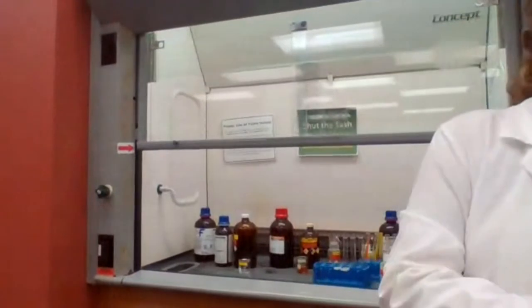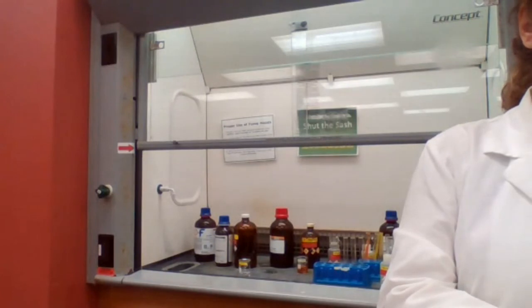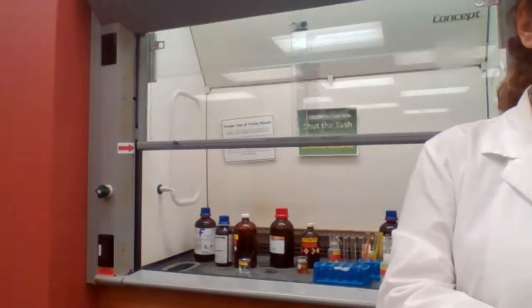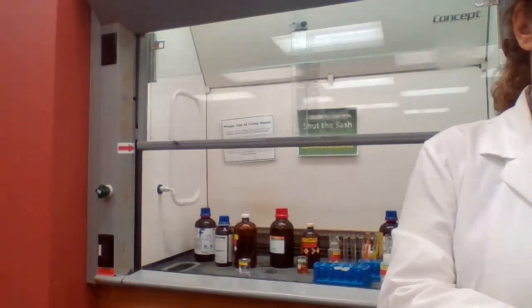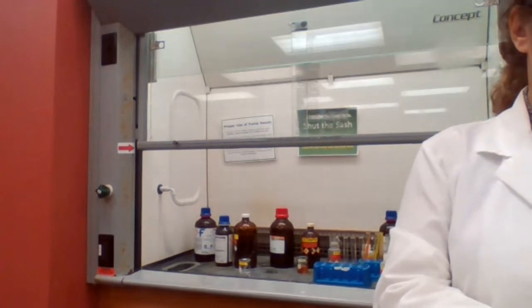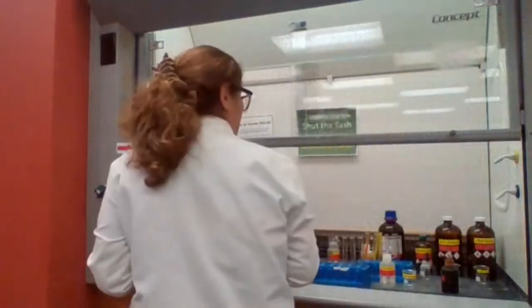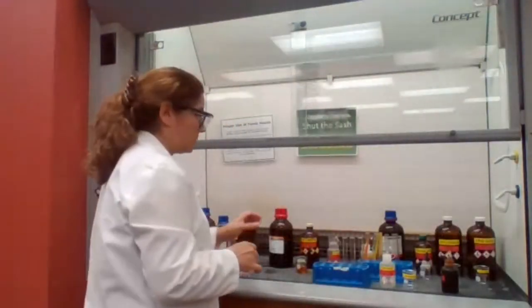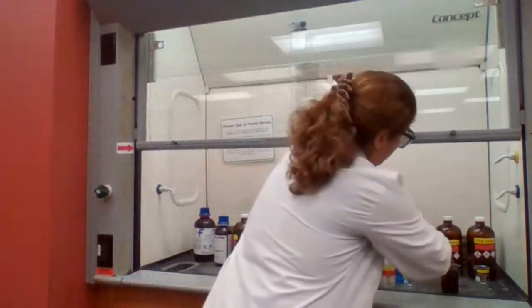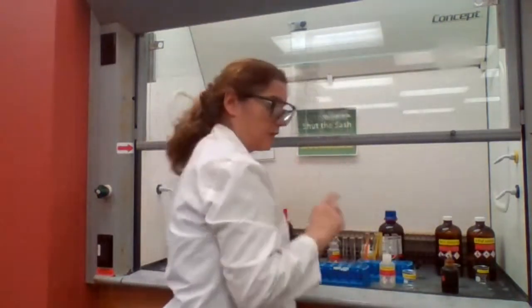What's the next step? Add 5 drops of chromic acid. Okay. Oops.